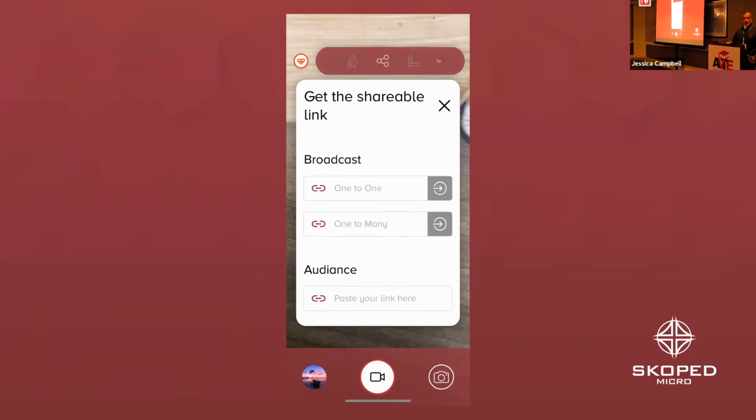We've got a couple of virtual questions. Someone asked, have you ever sent a picture of a cytology to a pathologist rather than mine? Yes, I have done that quite a bit. The question was, have I ever just sent pictures or videos to a pathologist instead of the whole slide, and would that work? Yes. One of my closest friends is a pathologist, so we've been playing with that for multiple years. Digital pathology is becoming a very common practice in human medicine, and it's trickling down to us.